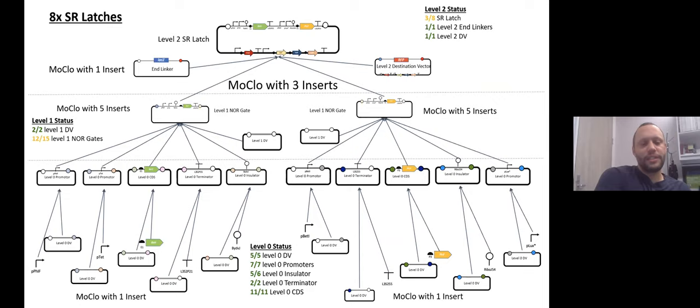Research groups can use them. We can archive and store them. And it vets our automation process. So he's doing this using that automated but yet manual process. And then what he'll be doing next is transferring these protocols to be able to be run on our robotic platform. So they'll be available.